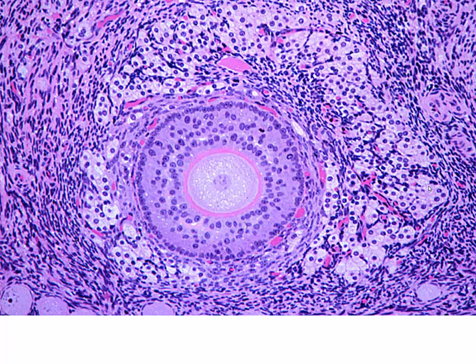This is one of the images that we saw from lecture. This is a perfect example of a multilaminar primary follicle. Here you can see the multiple layers of our granulosa cells, zona pellucida, and then our germinal portion, the nucleus of our oocyte. Outside we have our theca interna cells, and we have our stromal type theca externa cells.